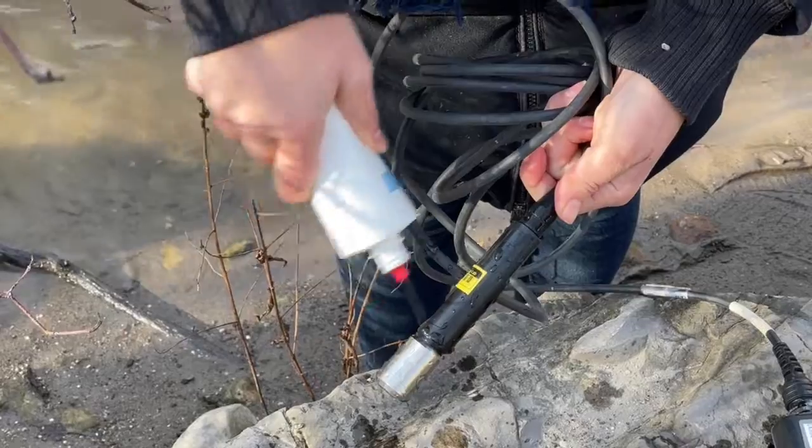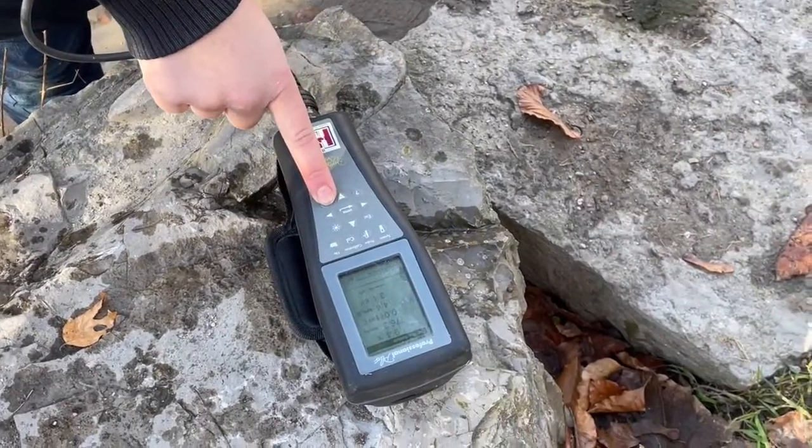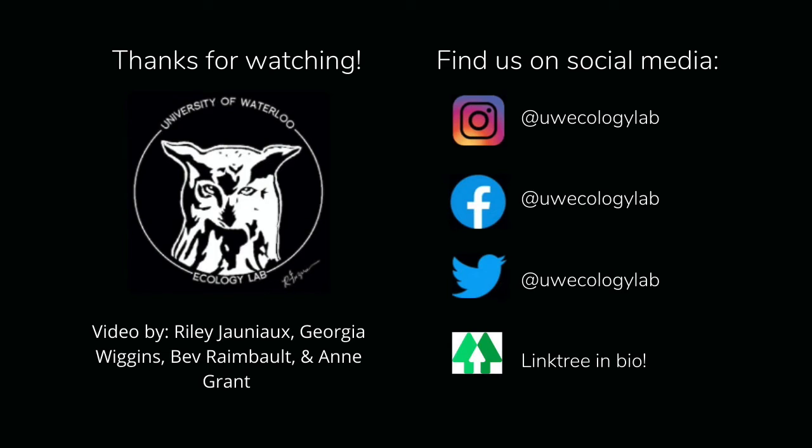When you've finished, make sure to thoroughly rinse it with tap water, and then turn off the meter.